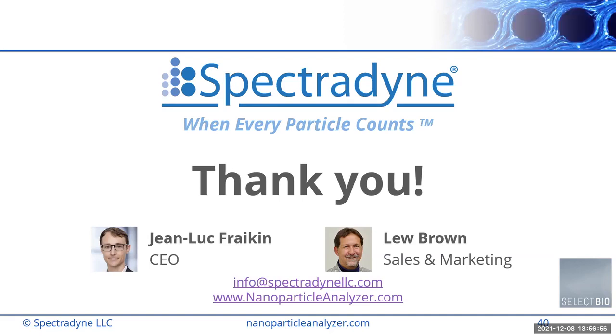Does that make sense? Okay, and is that automatically spit out in the data report? Does it take that final volume pushed through into account? Yep. Maybe depending on viscosity? Yeah, the measured volume is one of the parameters in the metadata of the sample. Oh, okay. I haven't hacked deep enough to see that. It's in the Excel report, the run report at the end of the measurement that you create every time. Okay. That Excel sheet, one pager.